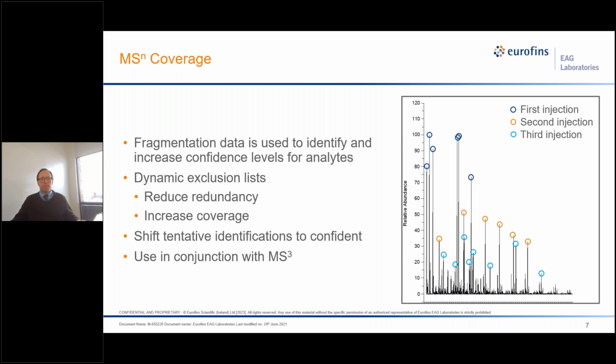Now, we don't have to do this all the way until there are no more peaks to be observed, because really all we have to do is make sure that we get full coverage of MS2, or better, down to the AET.